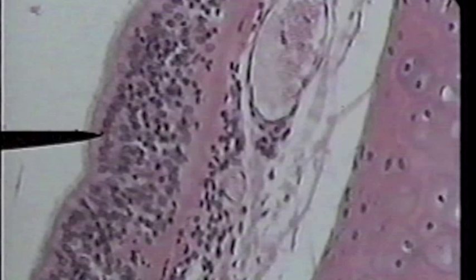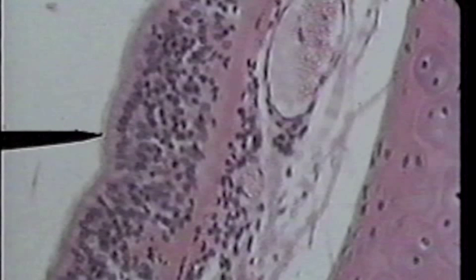Just left of the apical region, or the cytoplasmic region of the columnar cell, we can see a row of cilia. These cilia are visible — just a little haze almost, a fringe on this layer. The very tip of the pointer is on the cilia of the stratified columnar epithelium of the trachea.